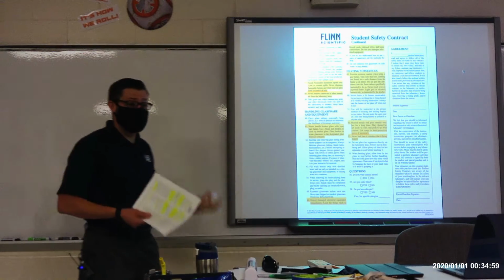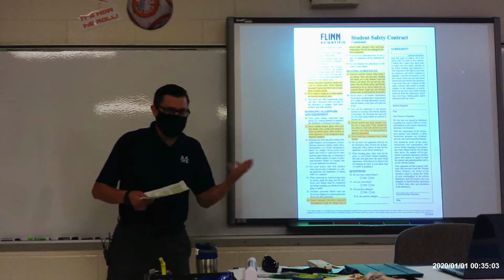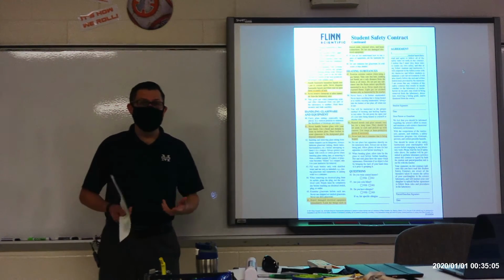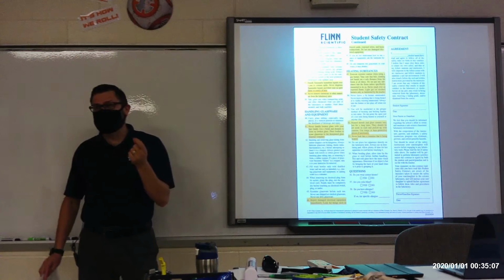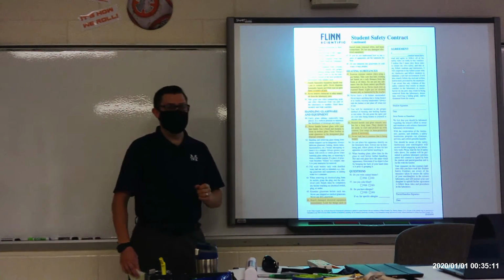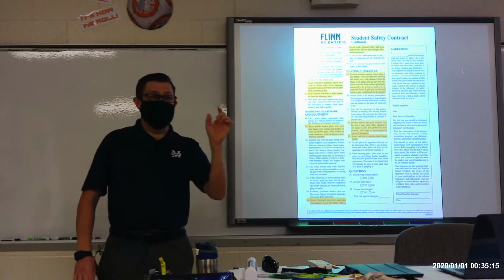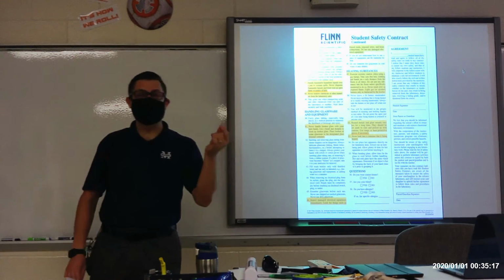Obviously, glass can break, so we need to be careful anytime we're using glass. We have some glassware that we will use. The most common piece of glass that we will use in this class, we'll actually use next week when we use the microscope slides. They are little pieces of glass, and when they break, they are notoriously sharp.